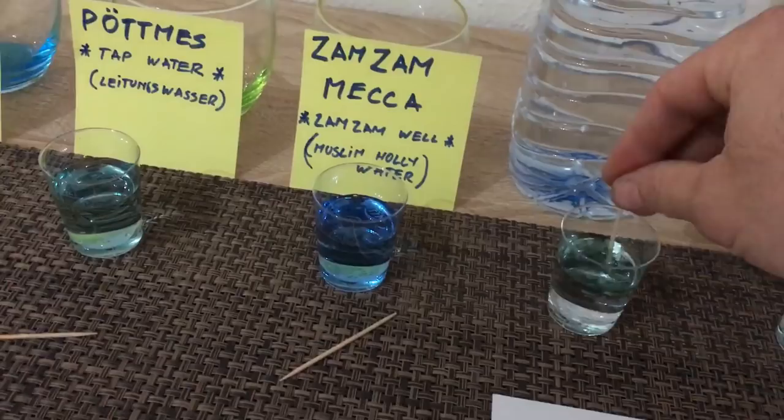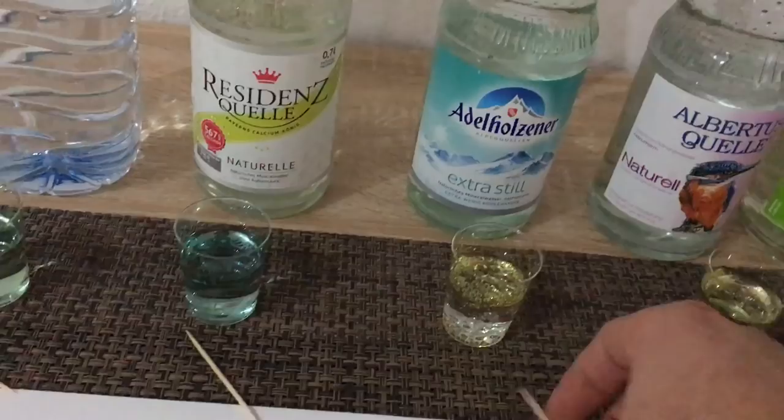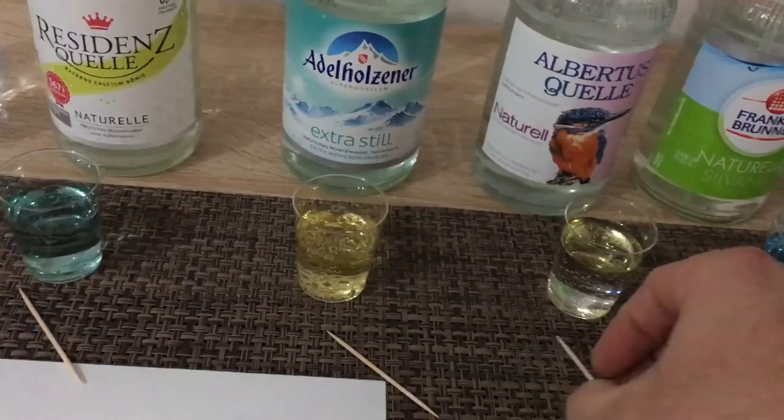Zamzam is pretty blue — incredibly blue. I'm just looking at the test now; I probably should have put a white sheet of paper underneath so you can see the coloring better compared to the other ones.